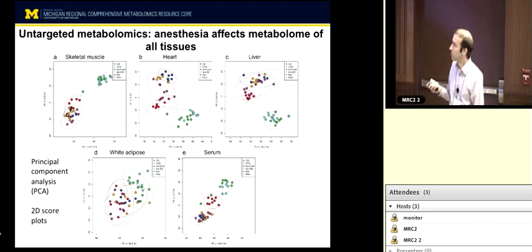When you look at some metabolites, maybe less so in triglycerides, but in free fatty acids and in central carbon metabolism, white adipose tissue and brown adipose tissue are both very metabolically active, and you can have an effect on the metabolome just as well here as you can on other tissues. So this was our procedure.